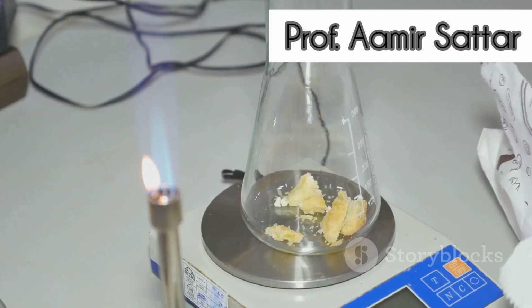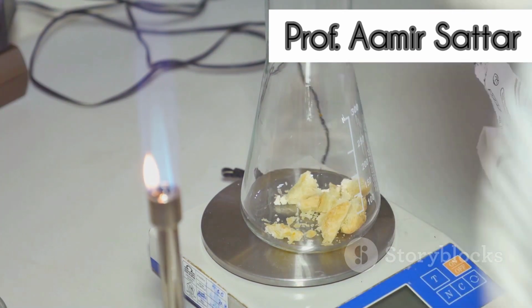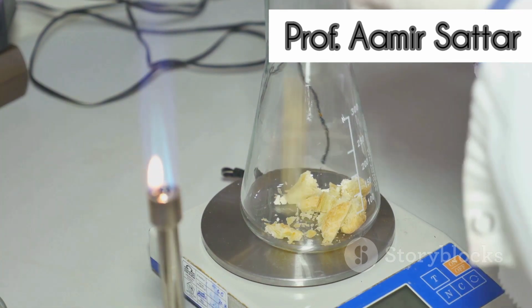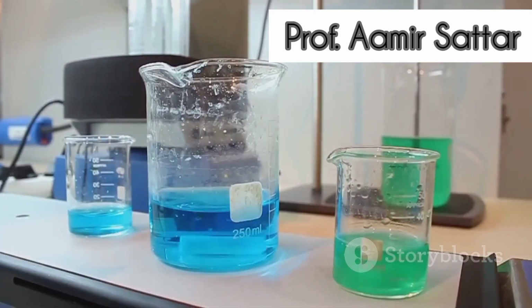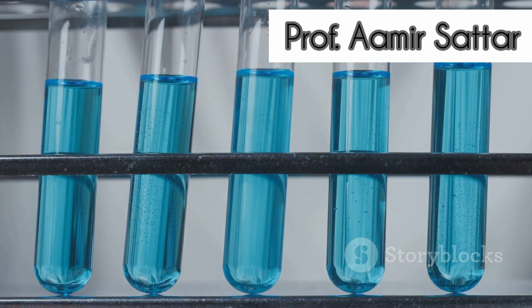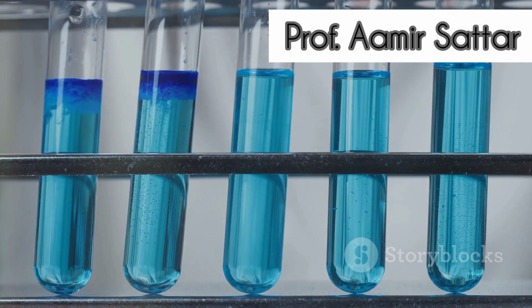For instance, in the Tollens test, a food sample treated with Tollens reagent results in a silver mirror formation, particularly indicating reducing sugars. Another specific carbohydrate test is the iodine test. When iodine solution is added to a food sample, a blue coloration indicates the presence of starch, a complex carbohydrate.